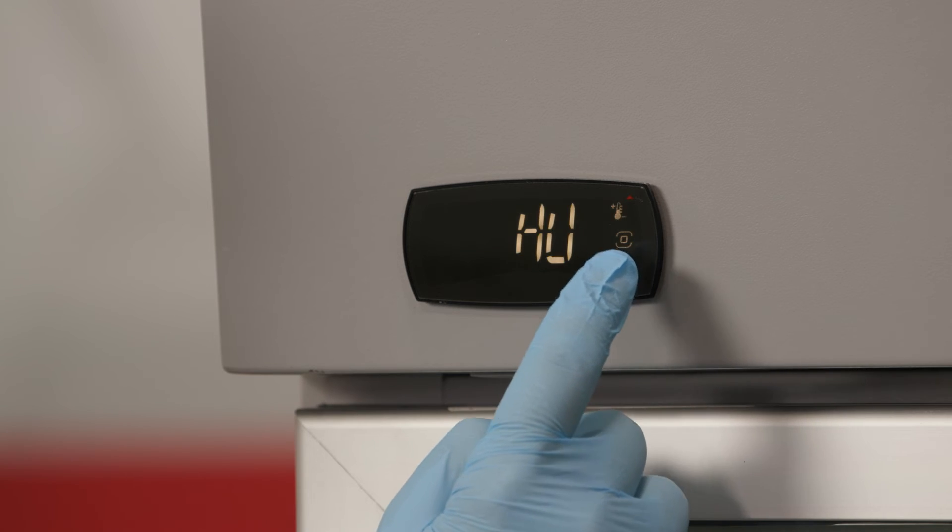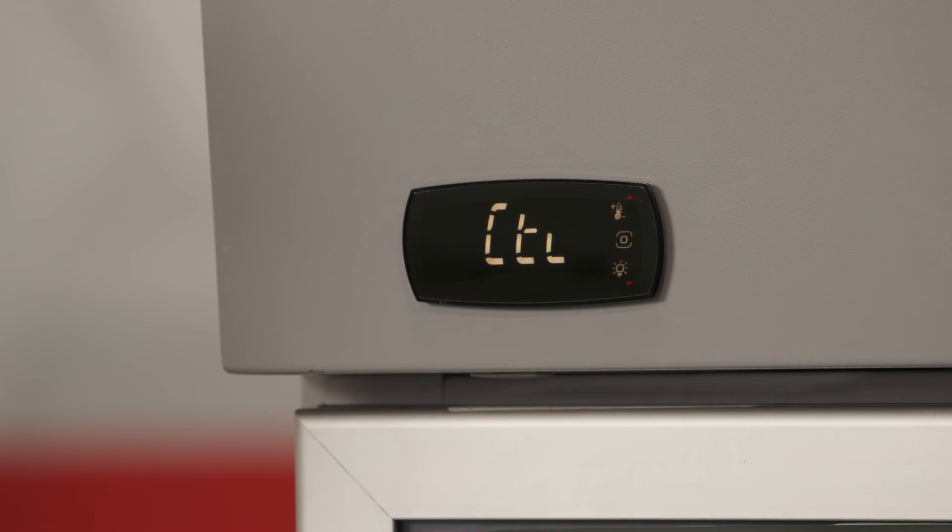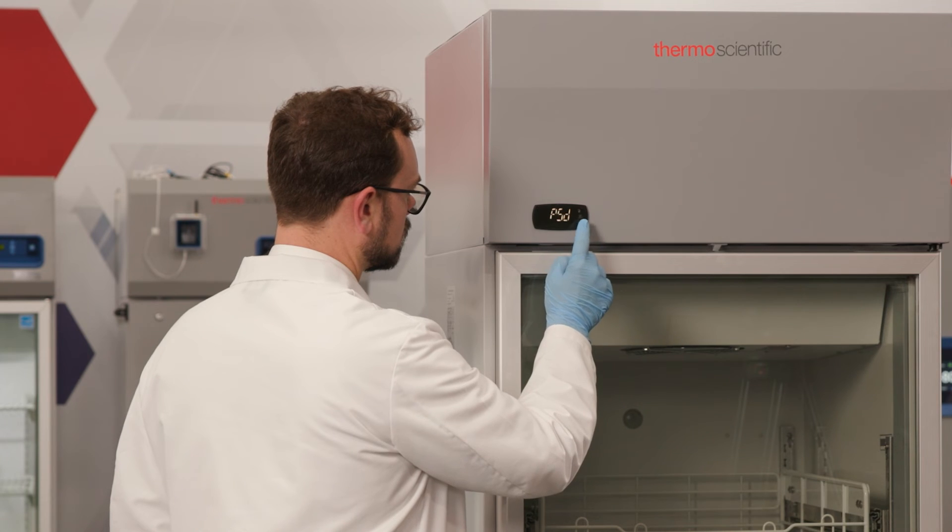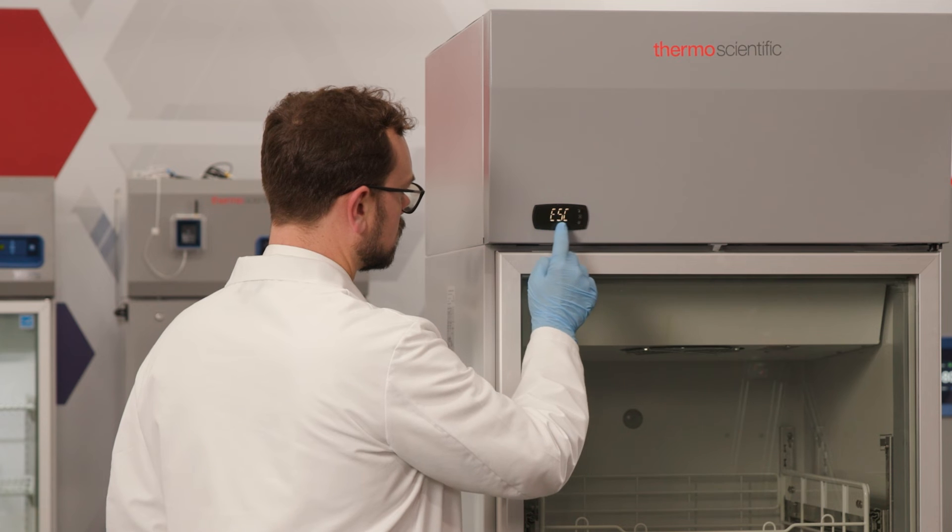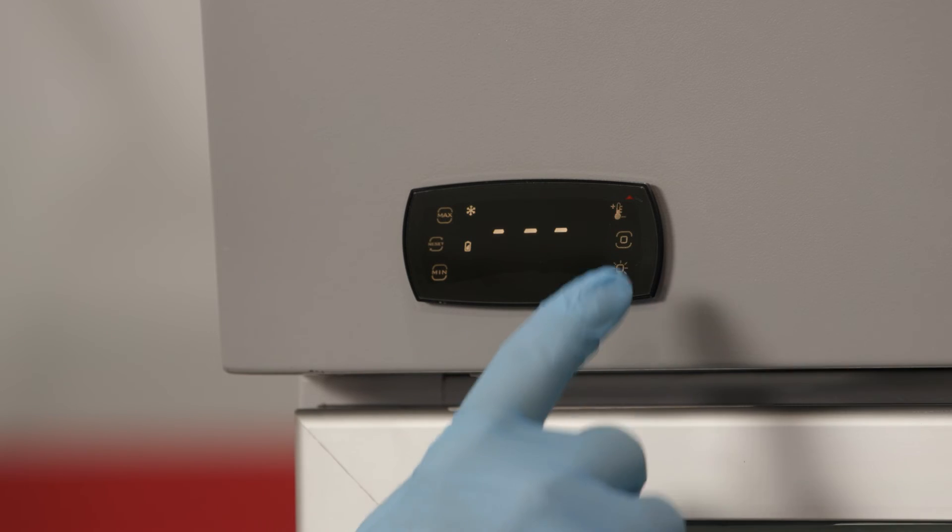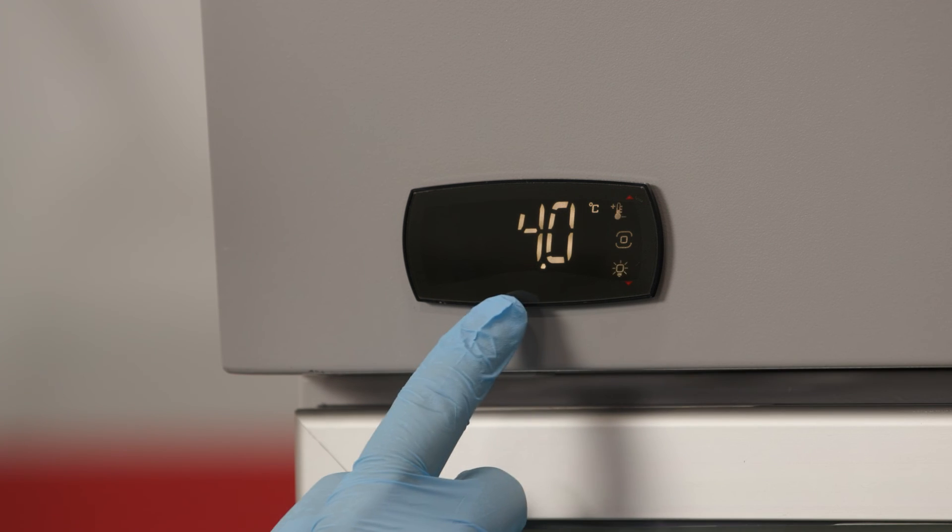Scroll through the CTL menu until you find ESC or escape. Press the program button to select ESC and return to the previous menu, repeating the process until you have exited the programming menu and the standard display appears on the controller. View and confirm your new temperature setpoint by pressing the temperature setpoint button at the top right of the controller.